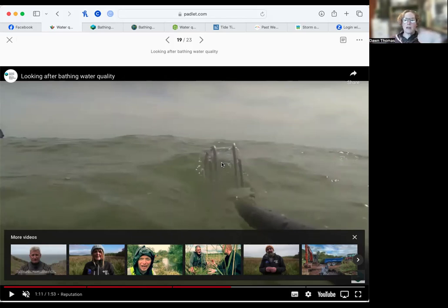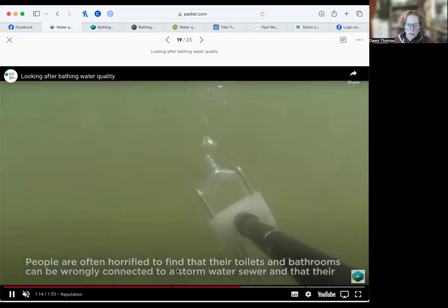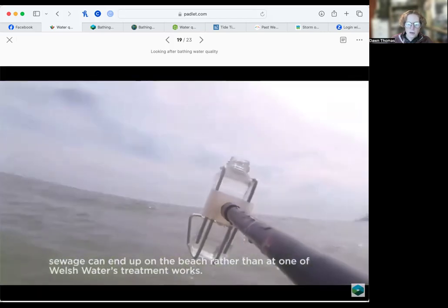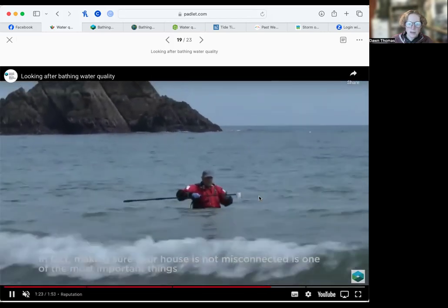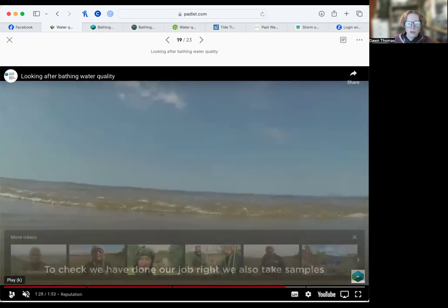You'll see a line on the bottle that says where you're going to fill it to. It's the very top line, so you have a little bit more space of air so that the colonies there can still stay alive. Then put the lid on, and then that's your sample. So if you watch the video with Hamish doing it, you can see he's doing it, inverting it, turning it up the other way. Once it's full of water, the air's all out, you can then check to make sure it's all right and then put the lid back on. You're going to basically do that, but without the pole.